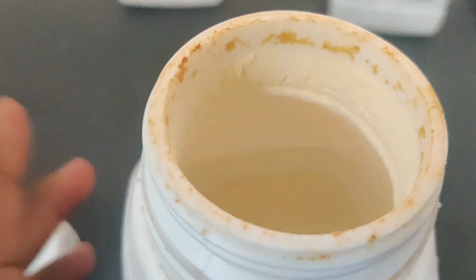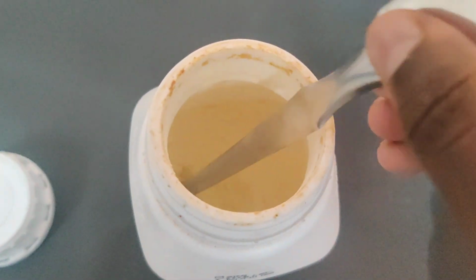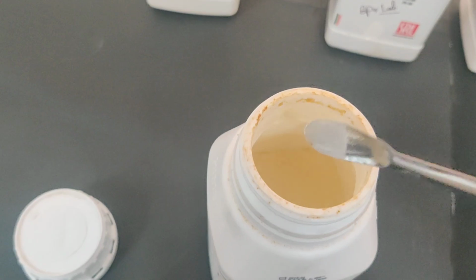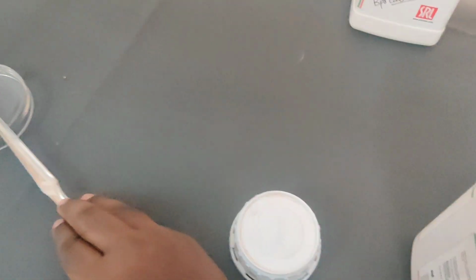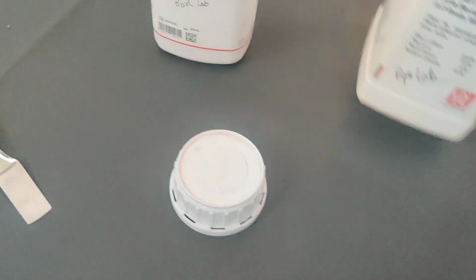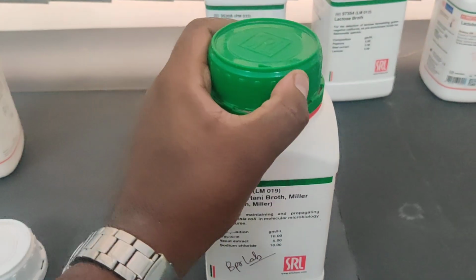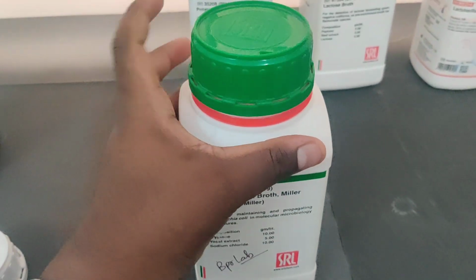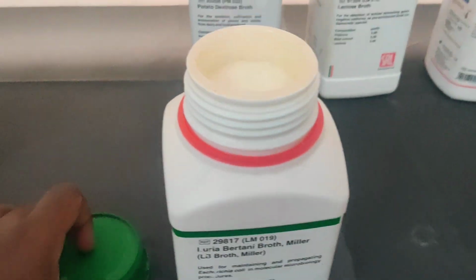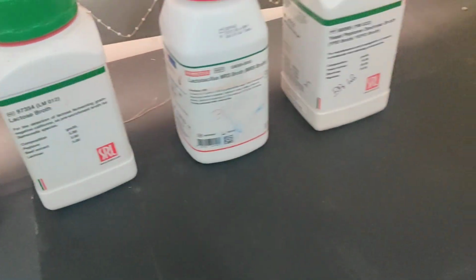Yes, I have opened it. So if you see, it will be in powder form. I will just take some, and you can see it is a fine powder. You have to take this, measure accordingly, and dissolve it in water. Most mediums will be like this, but you should take very high care that it should not get any water on it. If water gets on it, it will easily get solidified. And you can see each and every broth will be different. I'm not going to open this one because we are just going to do nutrient broth today. Okay, most broths will be something like this.